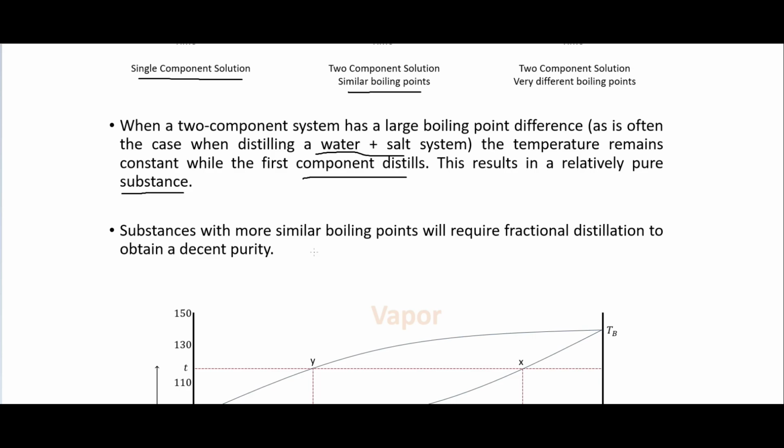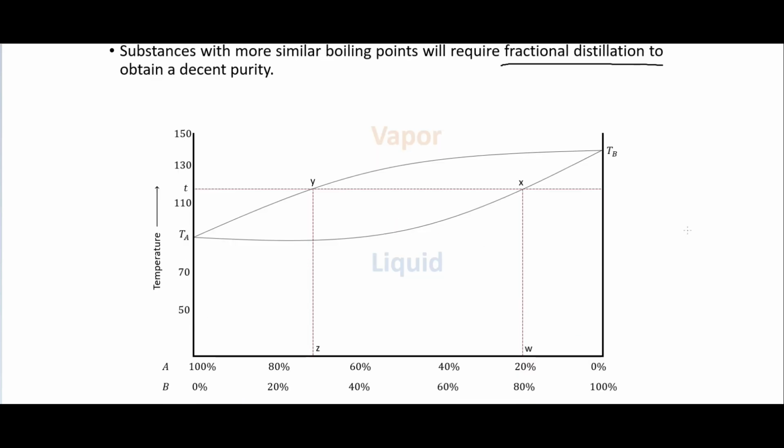Substances with more similar boiling points will require fractional distillation to obtain a decent purity, which I will talk about here in a little bit.